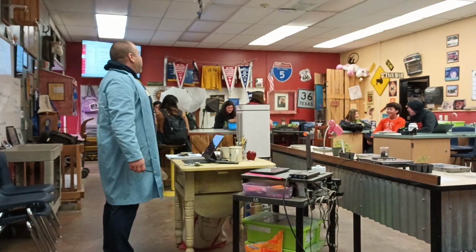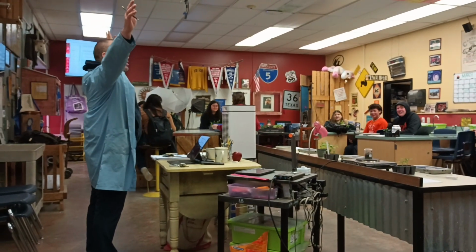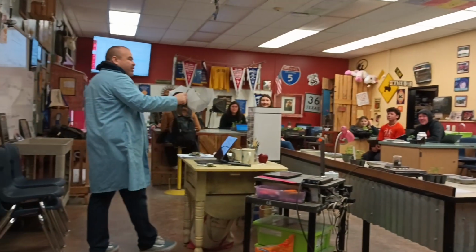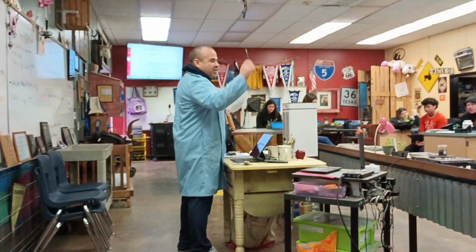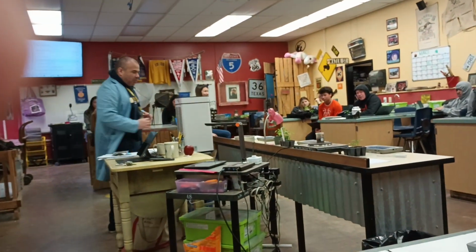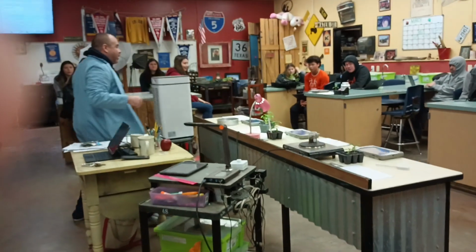Okay, good morning, class. How's everybody doing? Good morning. We're about to get started. As you can see, we have a lab set up for you guys. We have some soil samples on top of a stove. Be careful, they're pretty hot. This particular soil sample is going to be under a constant light. Be careful with the light, it might get hot.